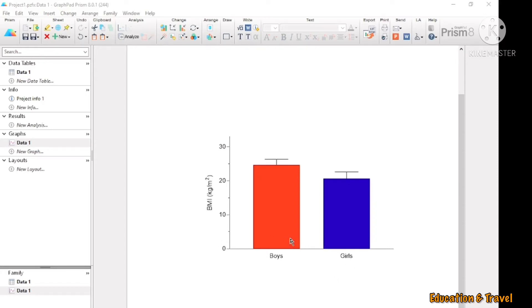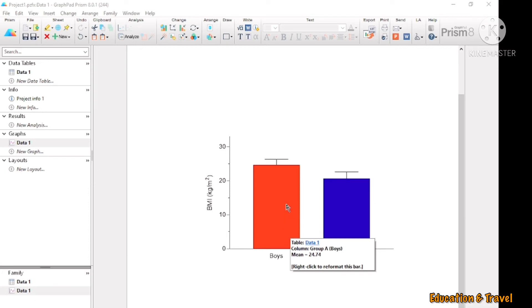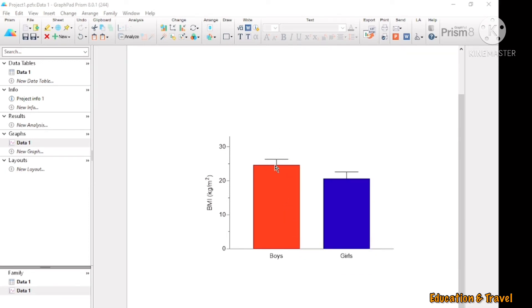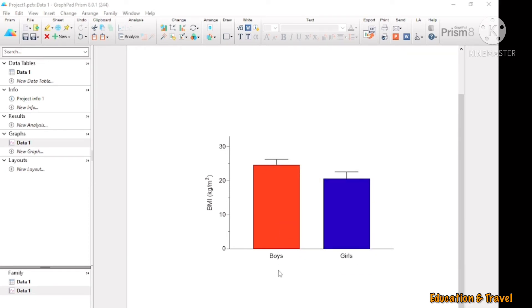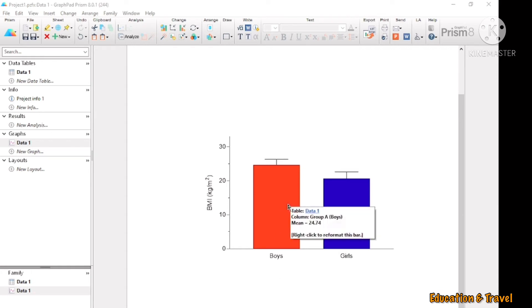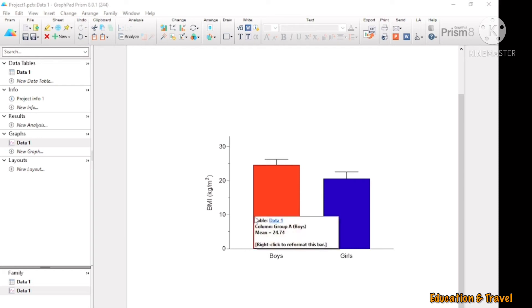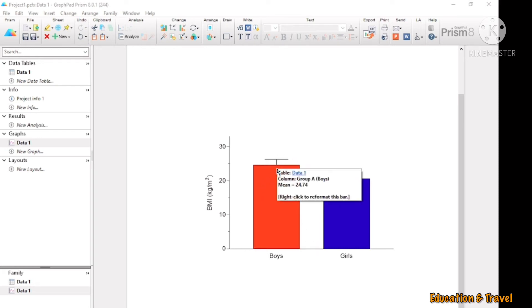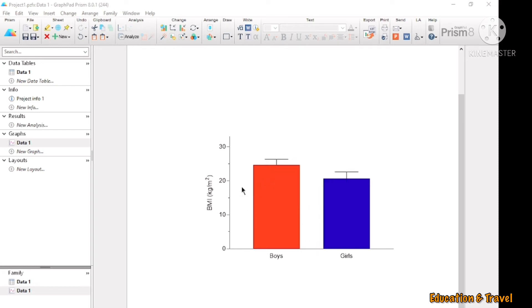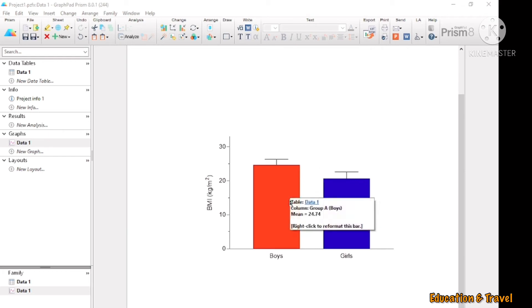Hi, in this tutorial I am going to show you how to make a bar chart with error bars using Pison software. Usually we use the MX access software to make bar charts with error bars, but compared to MX software, Pison software is very easy to use and the image quality is very high.